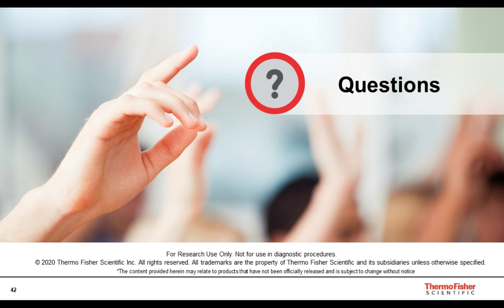As for non-coding regions, that's something we have talked about with the development team, and we're looking to understand what that would need to look like from a user UI experience to enable editing in non-coding regions. It's definitely been on our roadmap. So I can see where the question might be, how do you orient yourself without exon-intron boundaries, or some of the landmarks.